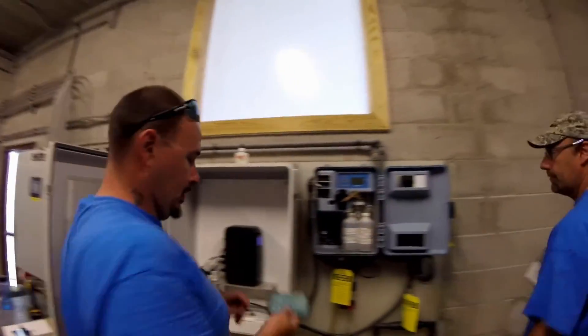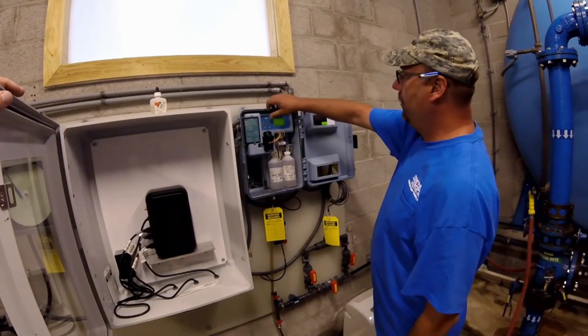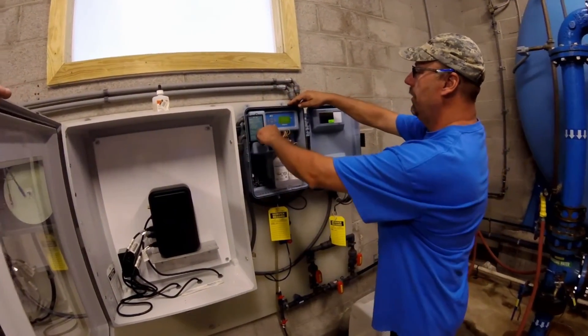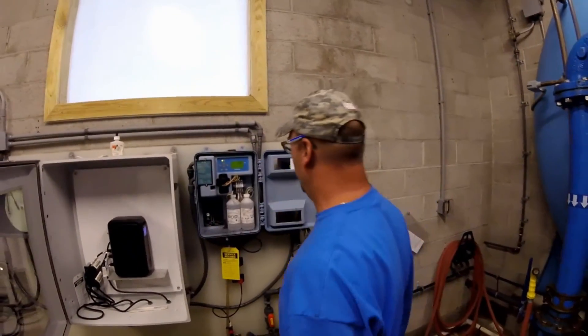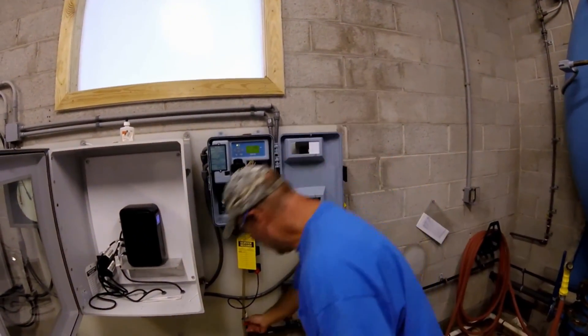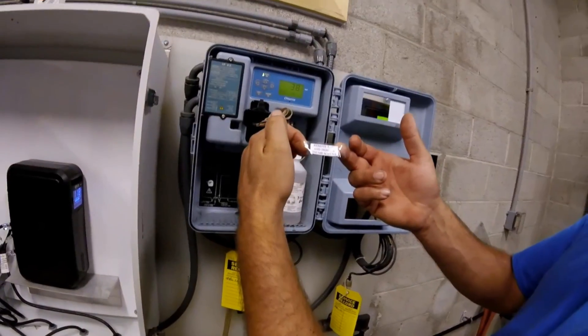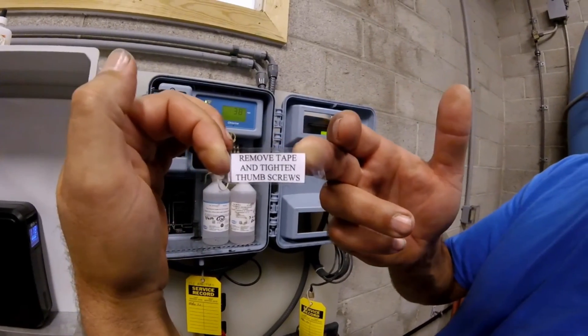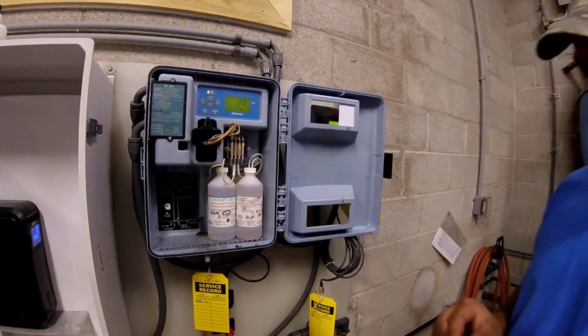Thank you, sir. All right, let's see what we can do here. We're going to go to menu, maintenance, prime. Did you turn the ball on? I did not.